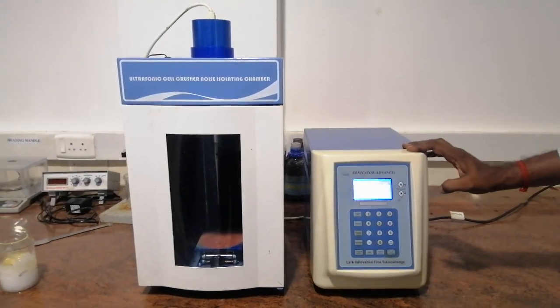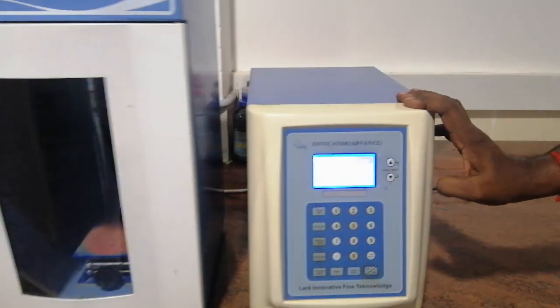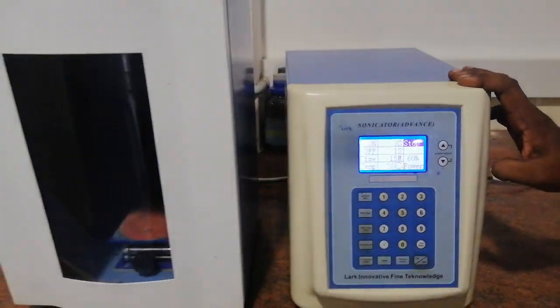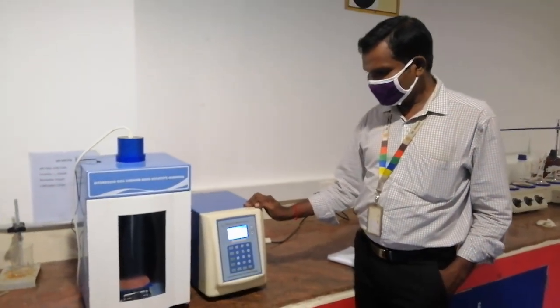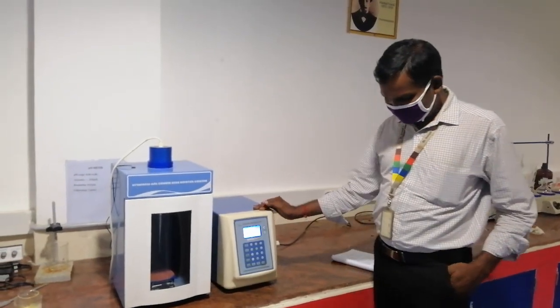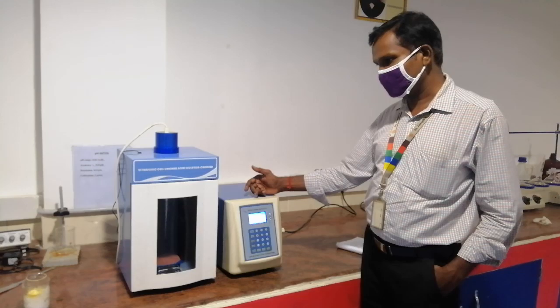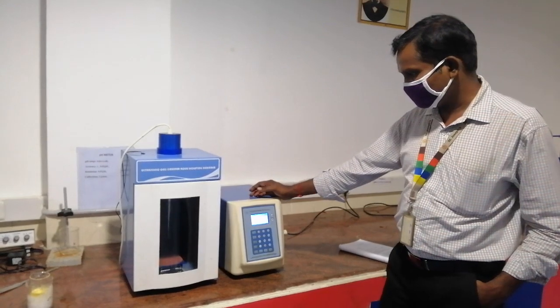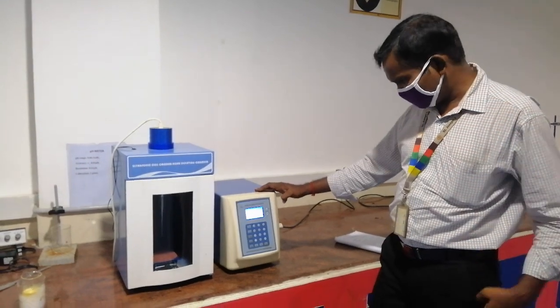Okay. So we have an experiment on ultrasonication. This ultrasonication is used for cell destruction. As part of this experiment, we are going to find the rate constant for cell destruction. As we discussed in the theory class, cell destruction using ultrasonication is assumed to follow first order kinetics. So by doing the cell destruction for repeated cycles for a constant time, and then plotting a graph between ln of 1 minus r versus the number of cycles on the x-axis, we can find the rate constant from the slope of this graph.